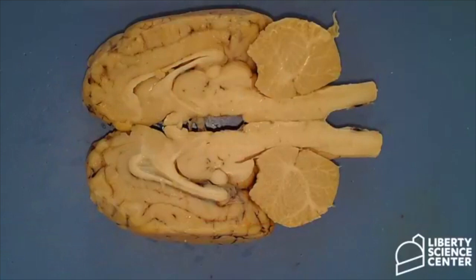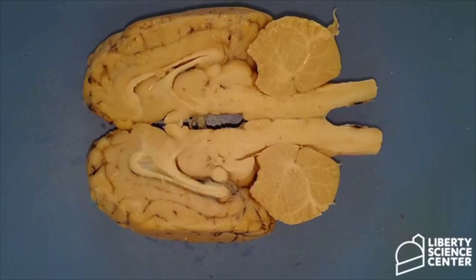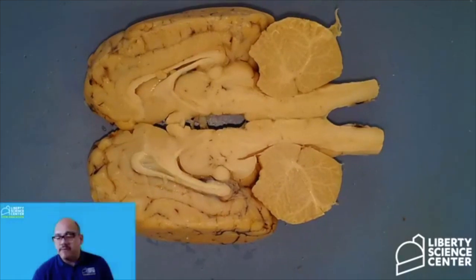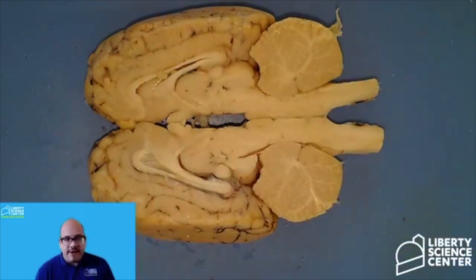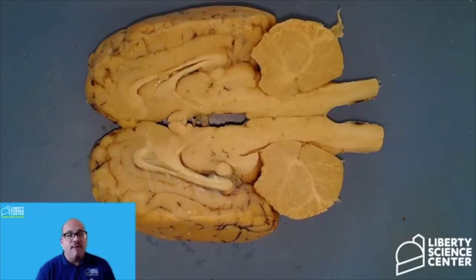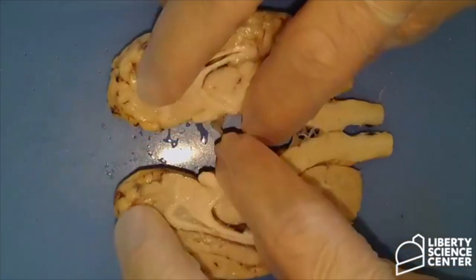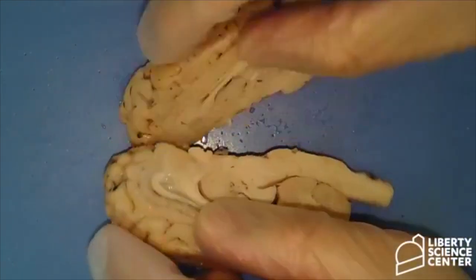All right, so let's go back to our dissection. There are a lot of different structures that we see here. For someone who is learning this for the first time, a lot of the structures look the very same. So I'm going to do my best to identify all the structures that we can, and hopefully you can differentiate them as I go through them. Let me just cut this off right here. There is some connective tissue there. Let's see which side would be best.